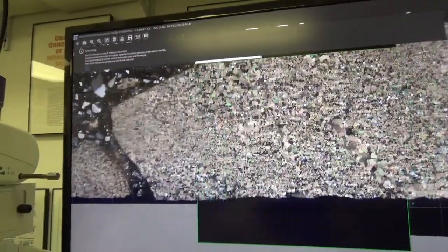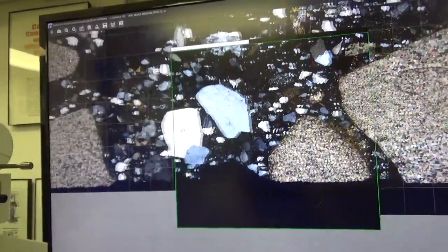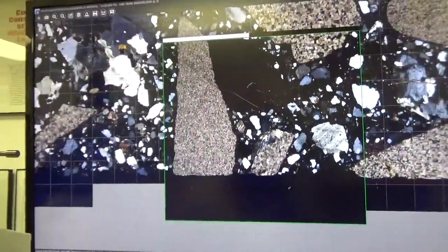That's a beautiful software that I used before, but you have to take about 40-50 images, with around 10% to 20% overlap to cover the entire slide, and then bring those images to Microsoft ICE, and the ICE will stitch them nicely.